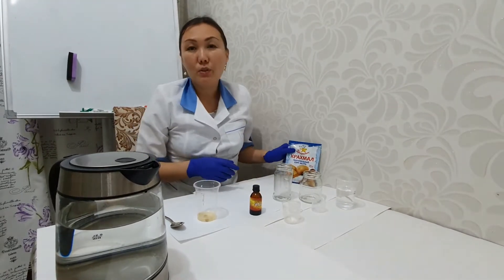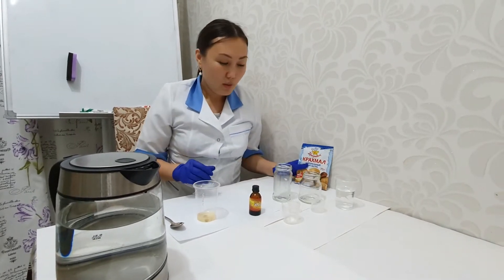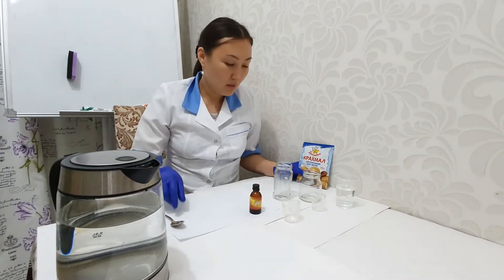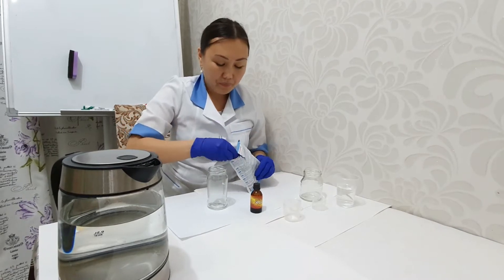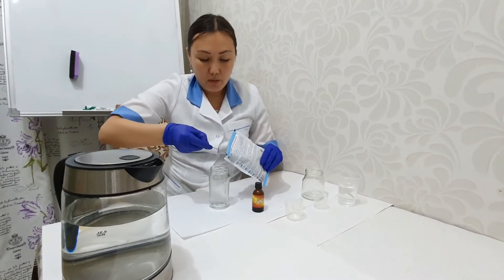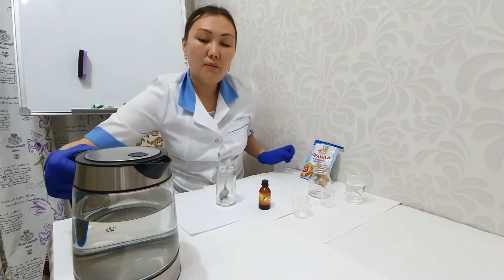We are going to use an indicator, which is starch. Now I'm going to prepare the indicator, because you need to have this indicator in advance. One spoon of starch solid must be dissolved in boiled water.